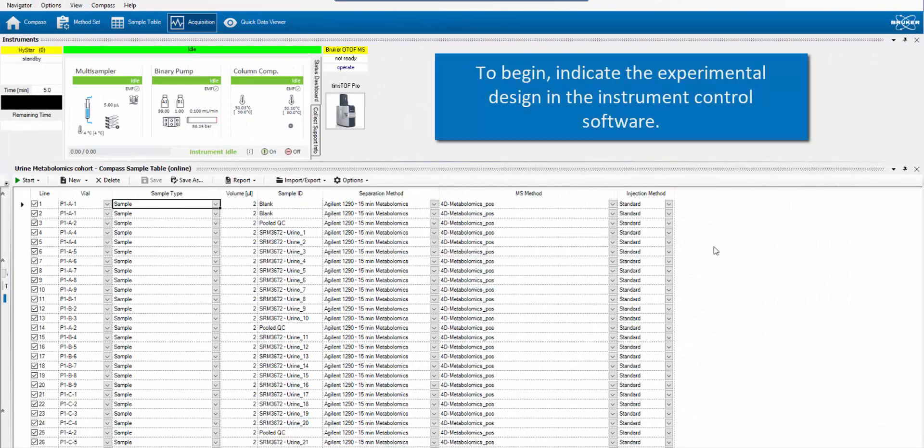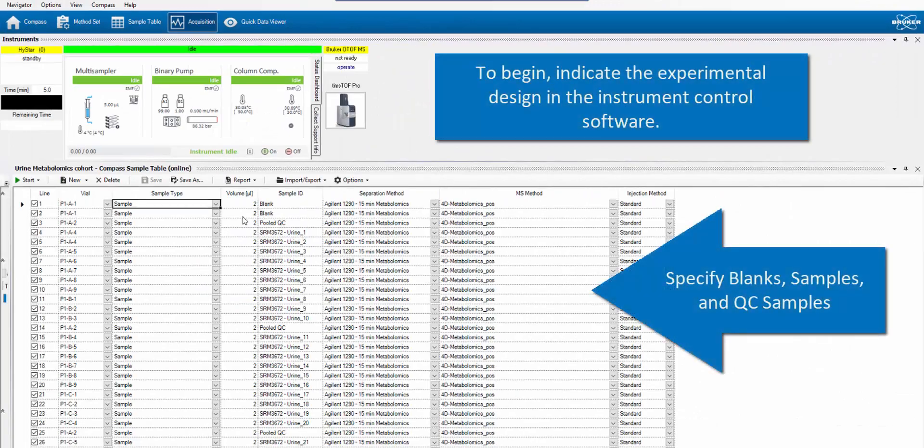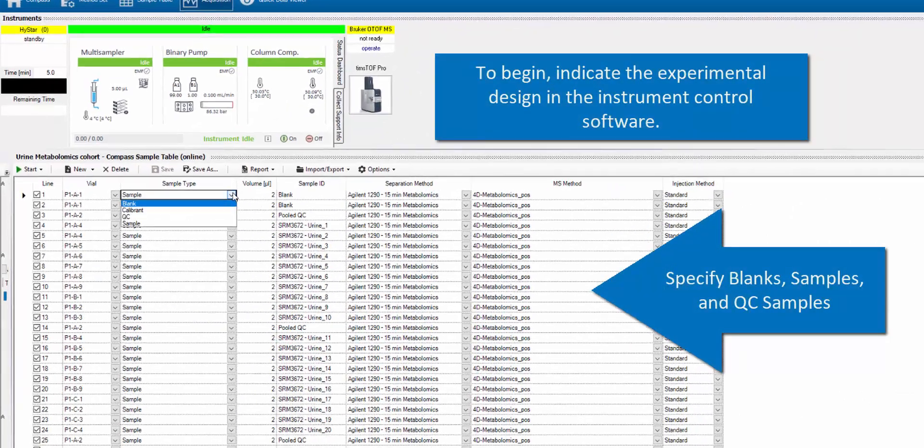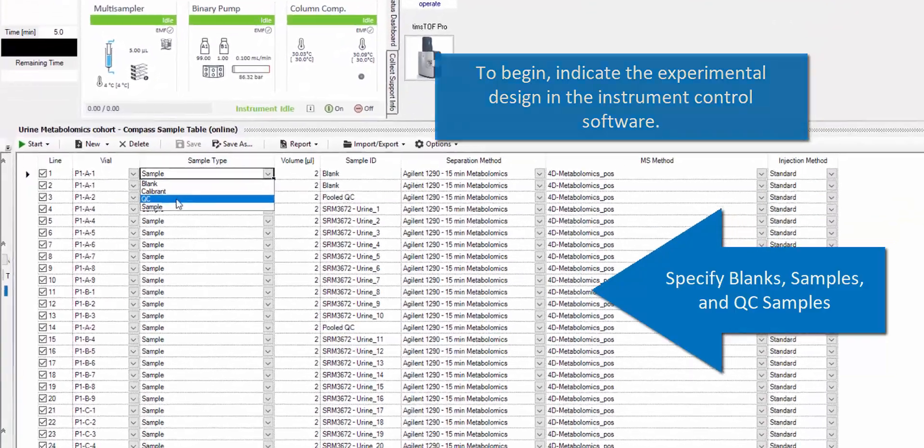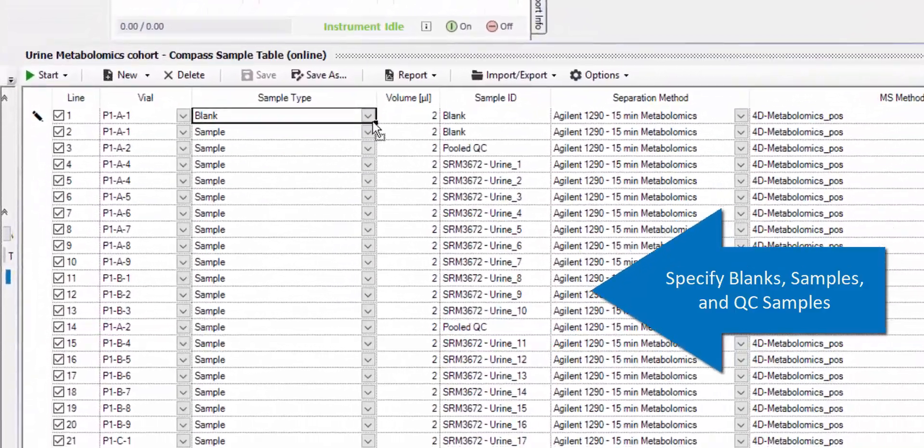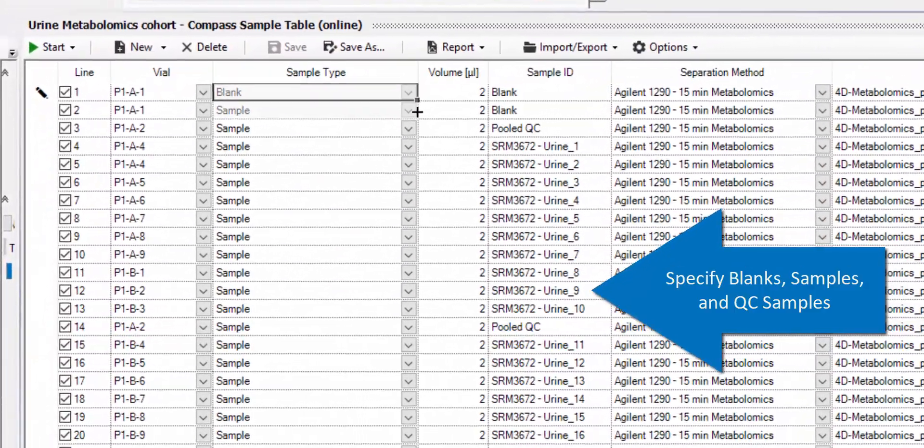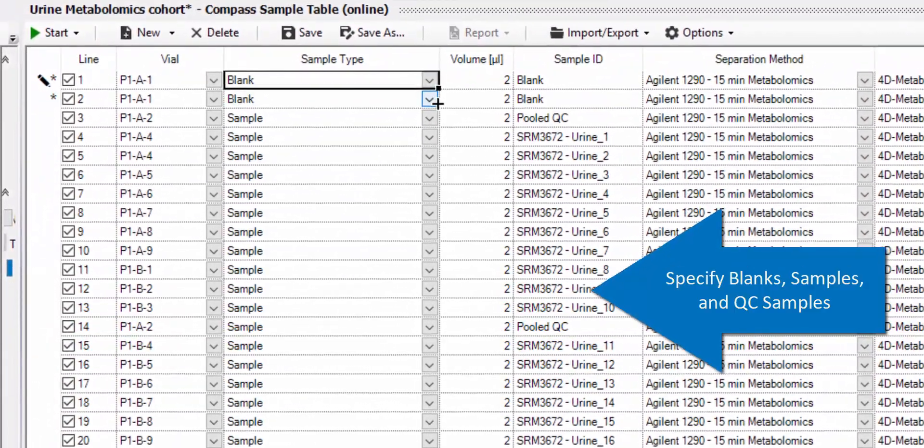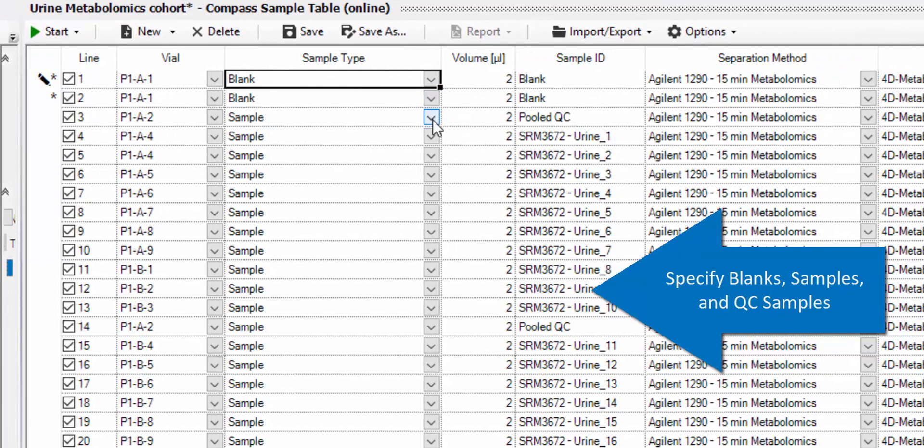In the initial experimental setup, sample types are predefined in the Sample Run List to inform the software which and how many sample classes it will be tracking.